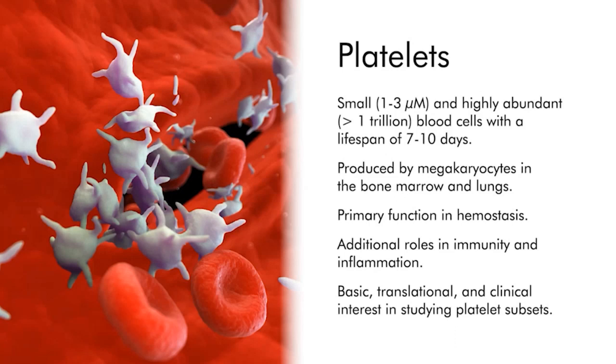And a major challenge is to develop methods to identify these subsets, as such methods would be useful for a range of basic, translational, and clinical applications. Specifically, we think that platelet subsets could serve as sensitive and specific biomarkers for a range of pathologies.